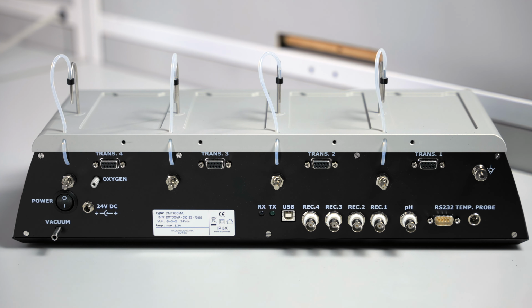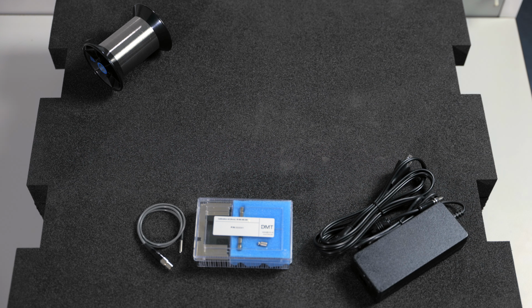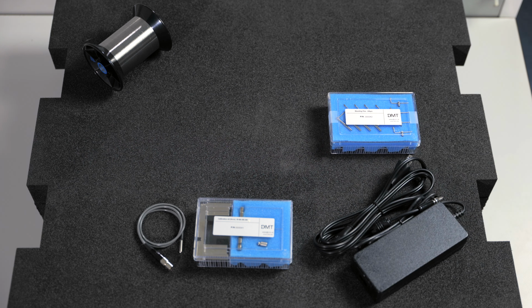The accessories for the system include a force calibration kit, a spool of 40 micron wire, a power supply, a temperature probe, an extra set of mounts, whether that is pins or jaws, 4 chamber covers, 4 funnels which will help when refilling your chambers, 2 kinds of grease for maintaining the system, 2 screwdrivers and replacement screws, 2 Allen keys, a ball-end screwdriver, a Myograph dust cover, and lastly, a USB stick containing the user guide and manual, as well as any licensing information.